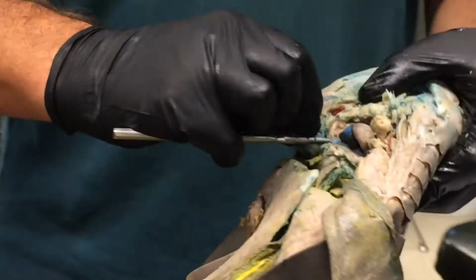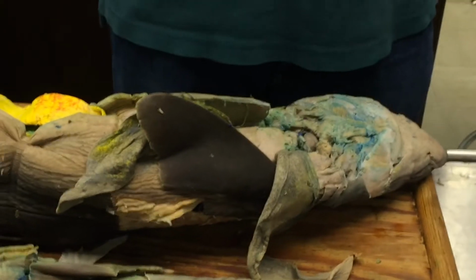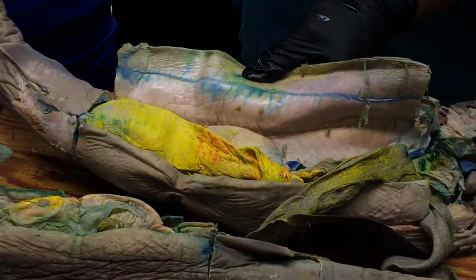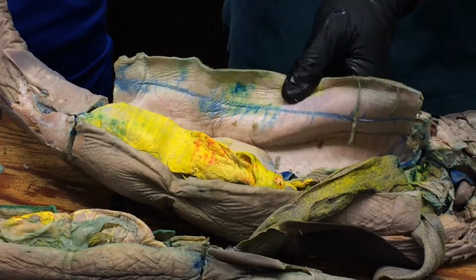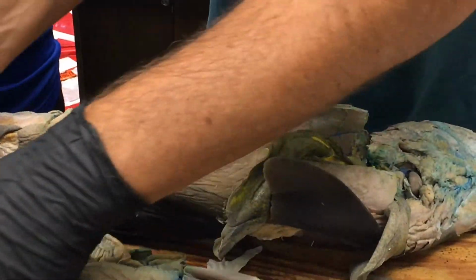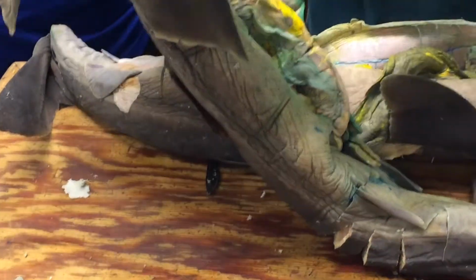Okay. All right. The next veins you're going to like because they're super obvious and everybody loves them because they're super obvious. The lateral abdominal veins. So these big ones that run along the sides of the abdomen. Lateral abdominal veins. And I think it was this one. Is this the guy who had a really good one?